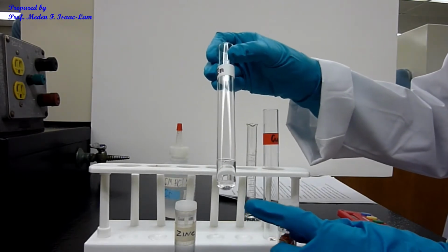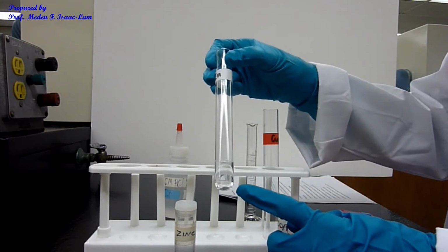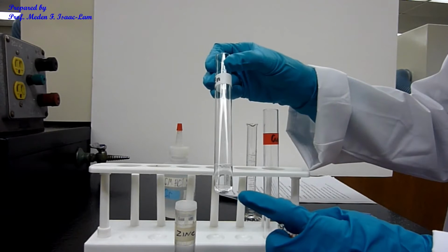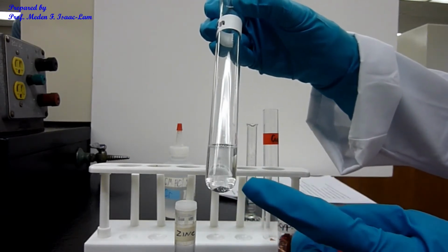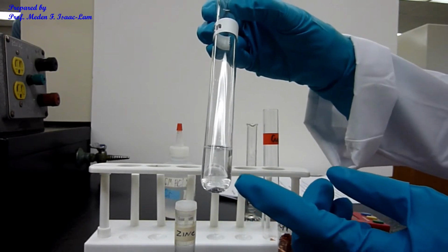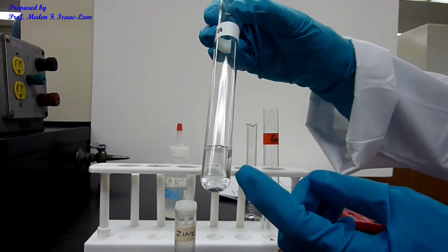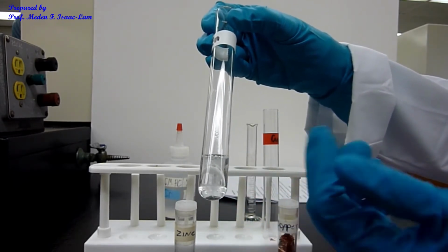So you see bubbles at the bottom. This is a reaction of zinc and hydrochloric acid, and it is evolving hydrogen, H2 gas. So it shows the reaction of the zinc with the hydrochloric acid. You see a lot of bubbles of H2 coming up.